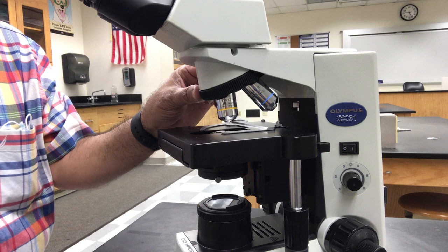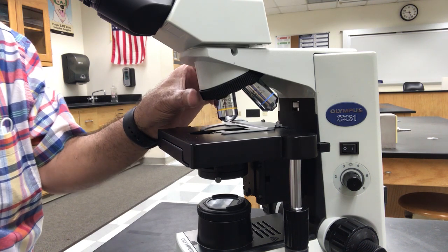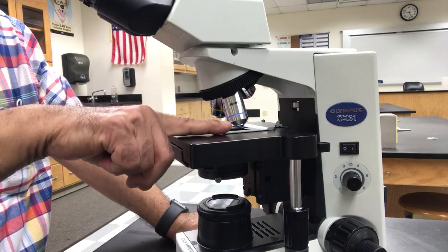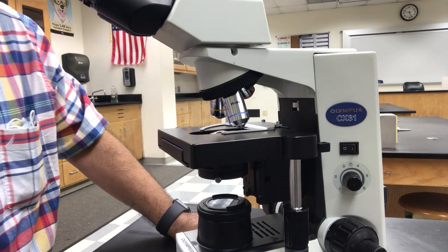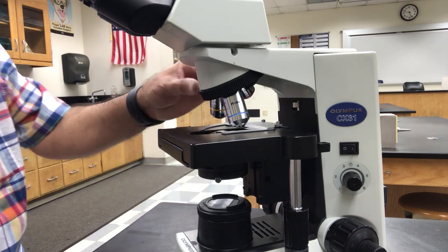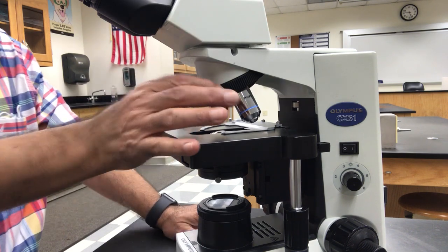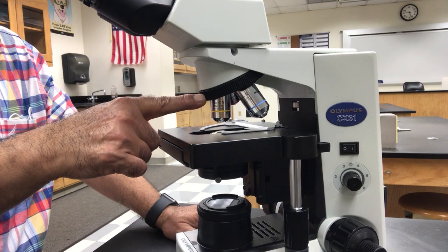That's the low power lens, and it can magnify 10 times. And the longest of the three is the blue ribbon one that can magnify 40 times, and it's called the high power lens. So scanning, low power, and high power, these three lenses are the objective lenses screwed onto the nose piece.